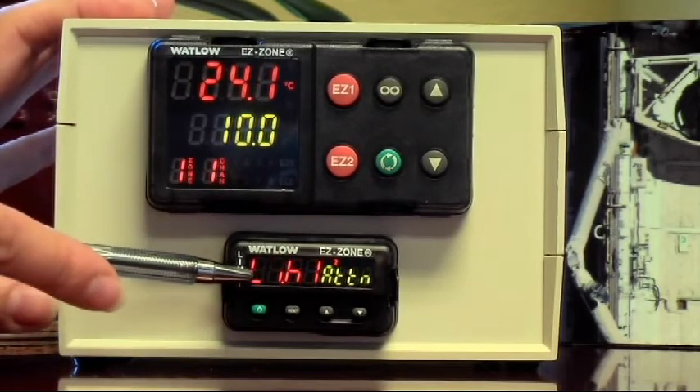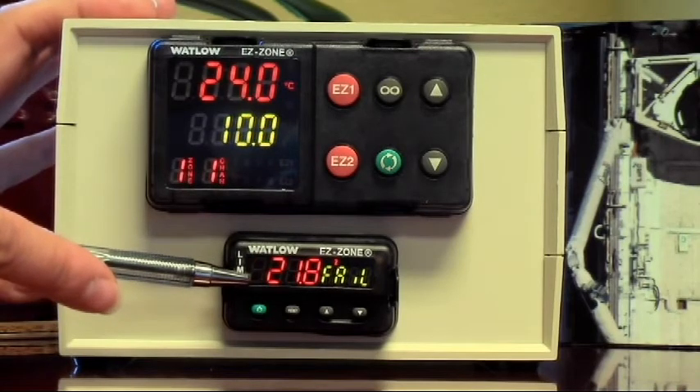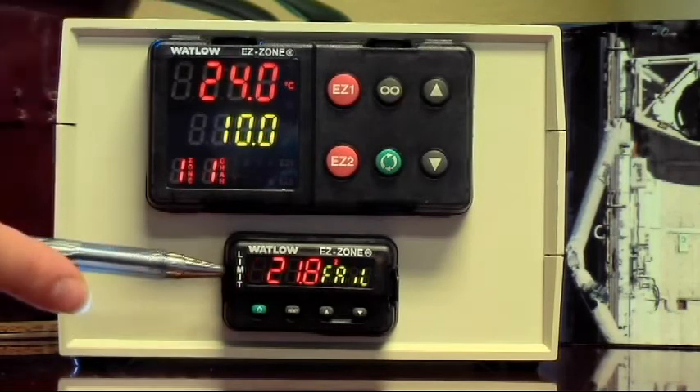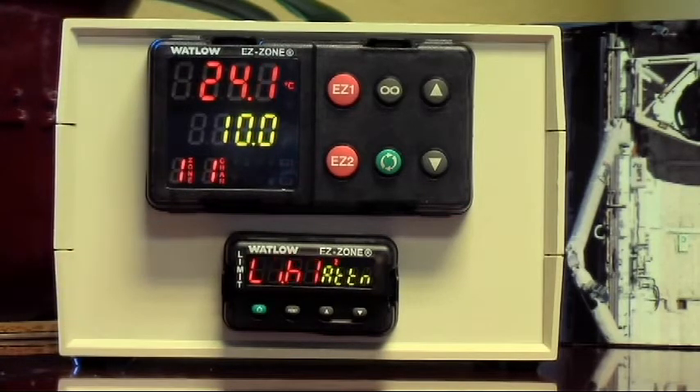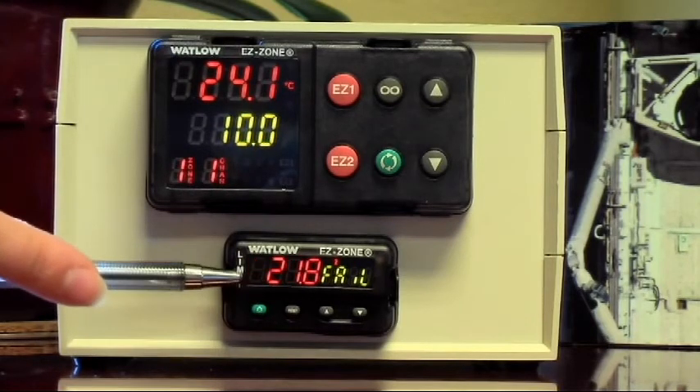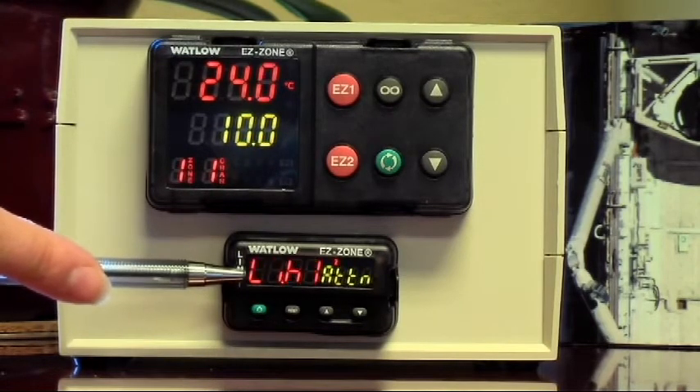You want to set the high limit not too close to your set point. For example, if your set point is at 150, don't set the high limit at 151, because the oven will fluctuate a little as it stabilizes. You want to set it at maybe 160 degrees.